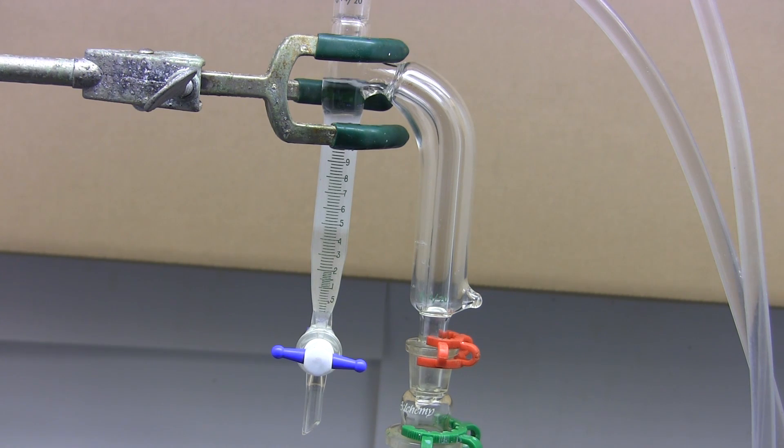The only time you do need to interact with the apparatus during the operation is if there's so much of the heavier phase that it starts overflowing and you need to empty the trap. So you usually select a large enough trap that you need to do this as few times as possible if at all.